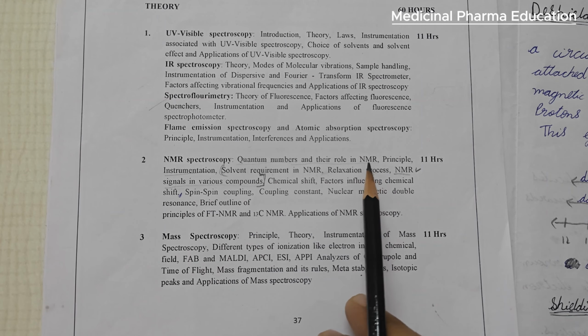Next, shielding. What is meant by shielding and de-shielding? These two topics are very important and they are very easy. When a proton is present inside a magnetic field or closer to an electropositive atom, more applied magnetic field is required to cause excitation. Such protons are called shielded protons, and this effect is called the shielding effect.